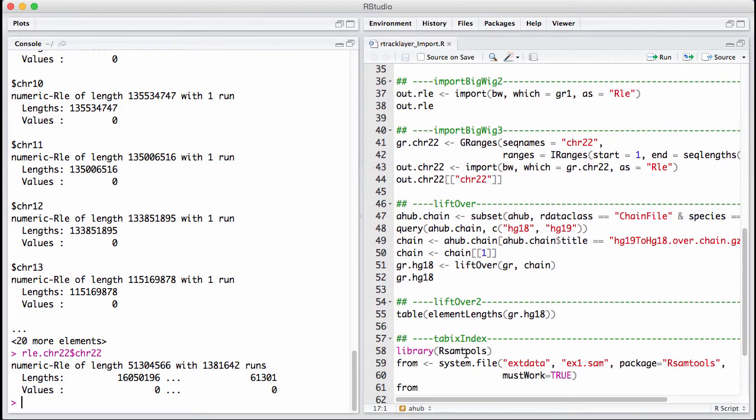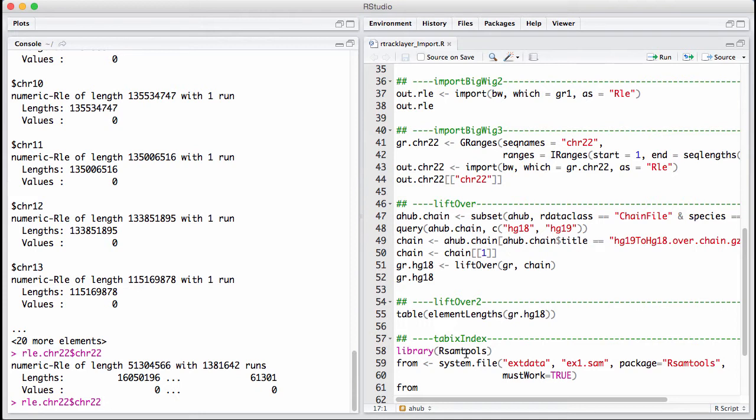Now, let's discuss something slightly different. Let's discuss LiftOver. LiftOver is a tool from UCSC that allows you to convert between different genome versions. And we use that a lot. But in order to use LiftOver, we have to have something that is known as a chain file.